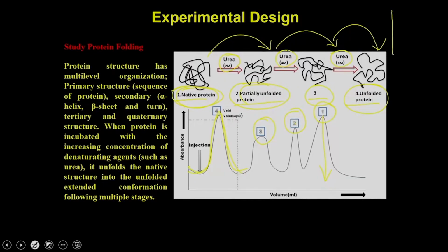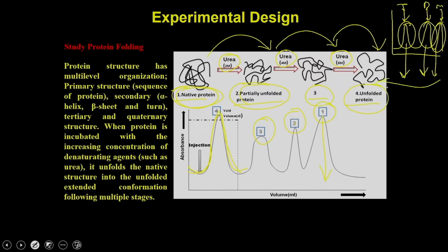can do is, if you run this protein on a gel filtration column, you are going to get 3 peaks, which are the tetrameric peak, dimeric peak and the monomeric peak. What you can do is isolate these peaks individually and then perform similar experiments with the individual oligomeric states, and that will tell you which oligomer is more stable and which oligomer is less stable.